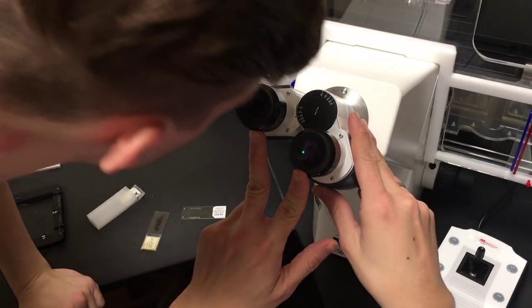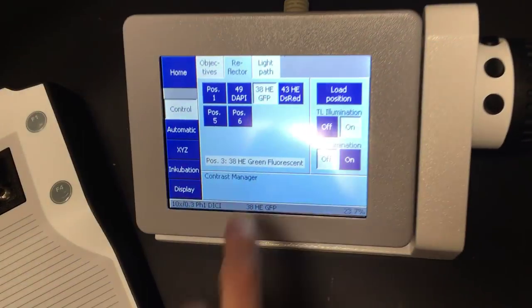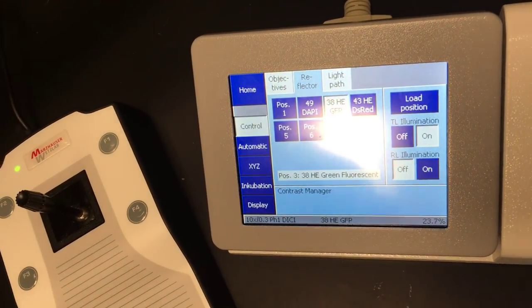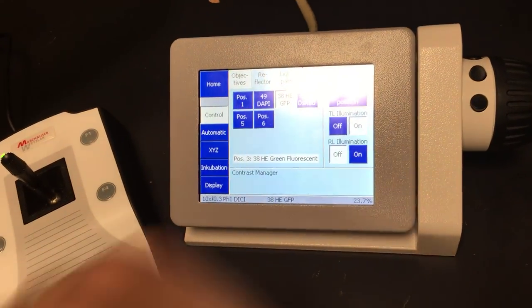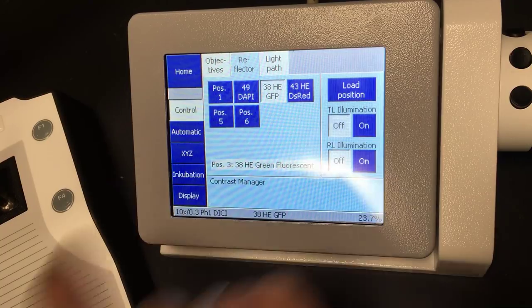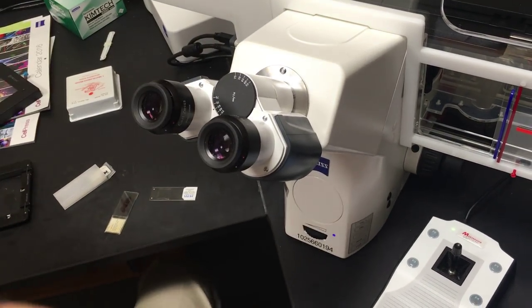If you see green coming through, that means there's a filter in the way. Go to the reflector—you have six positions in the filter turret, but right now you only have three filters: DAPI, EGFP, and DS Red. You can add another one, like a far red, in the future. But right now you've got three basic visible wavelengths—green, red, and blue. Any other position is an empty position, so if you hit one of them it moves to a position with basically just normal light.